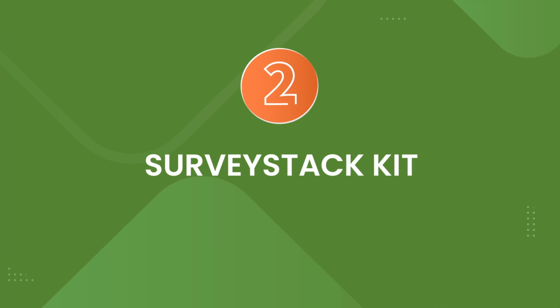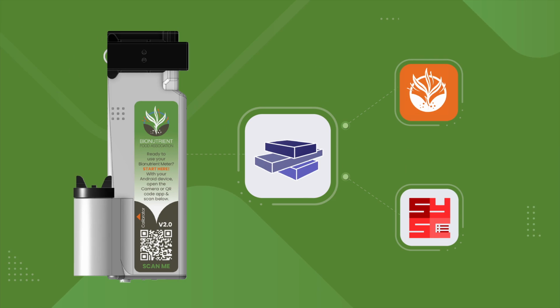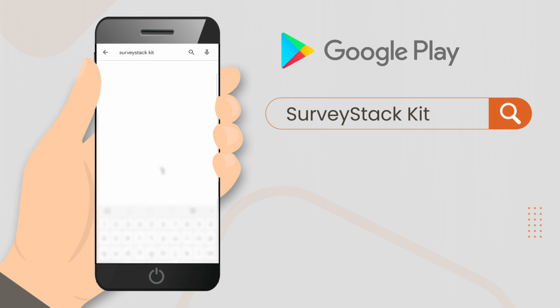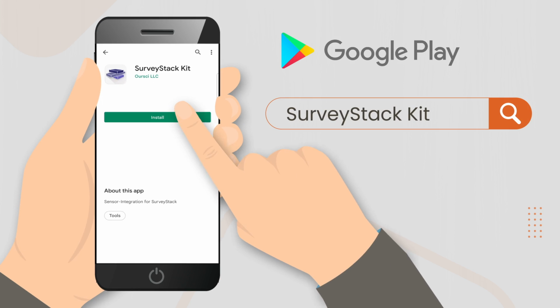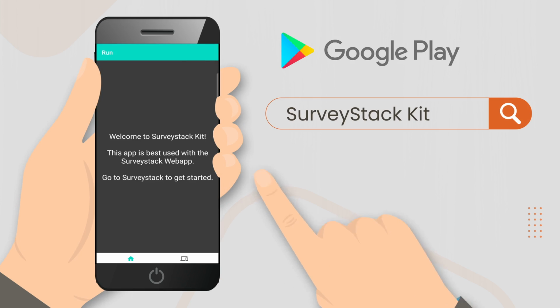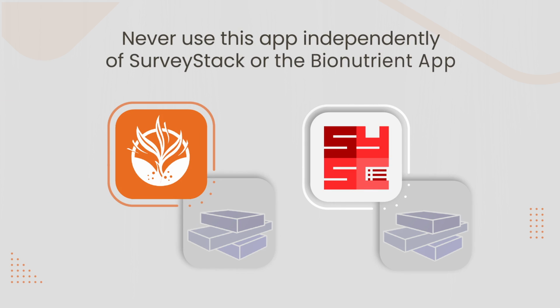For meter users, you'll also need to install a separate app to connect to the device called SurveyStack Kit. To install the app, go to the Google Play Store and search SurveyStack Kit by Our-Sci LLC. Install it. Please note, you'll never use this app independently of SurveyStack or the Bionutrient app.